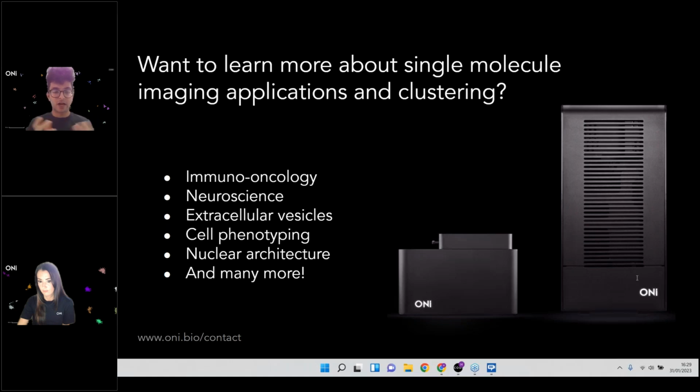And then you ran the same experiment but for 1,000 frames. The clusters should have more points in them, but HDBSCAN should still pick out probably similar clusters, because relative to each other, they will hopefully have all scaled in the same direction. And you might find that in longer experiments, the way the points distribute lets you separate out artifacts that way.